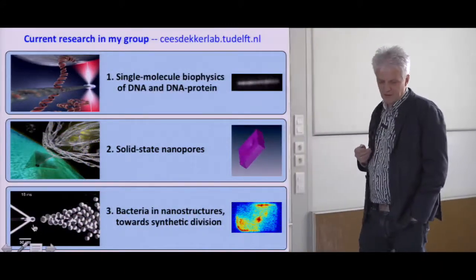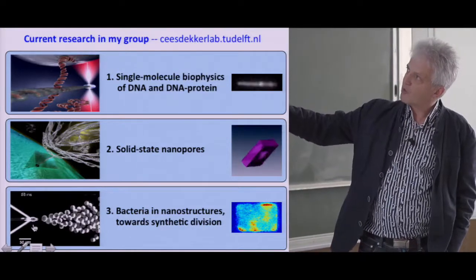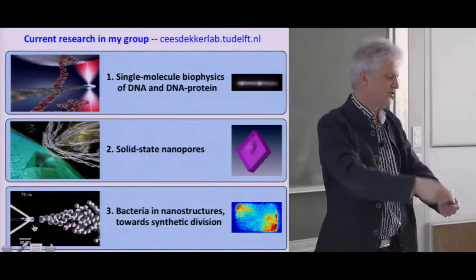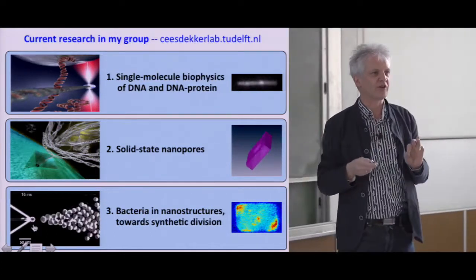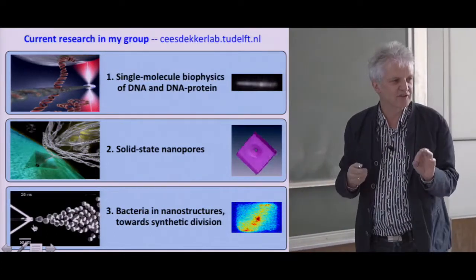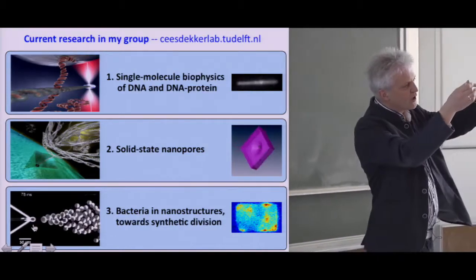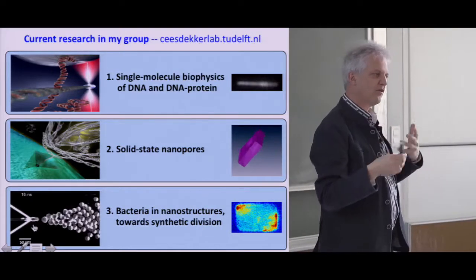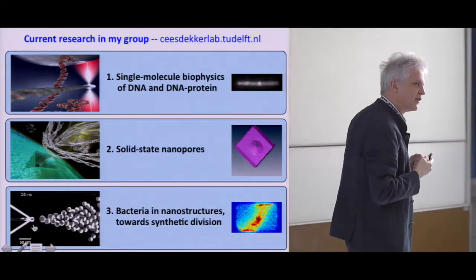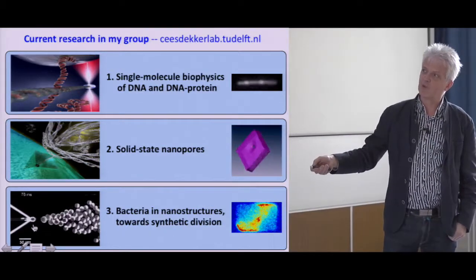Just to give a brief overview, my own group works in a number of areas. We work on single molecule biophysics, basically this toolbox where we do stretching and bending and measuring on single DNA molecules, DNA-protein interactions. We do a lot of work on solid-state nanopores, very tiny holes through which we traverse molecules like DNA, and develop sequencing technology based on that. And we now also do quite a bit of work on nanostructures to confine single bacteria.